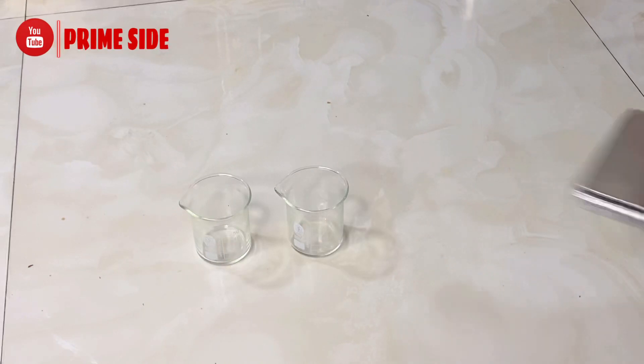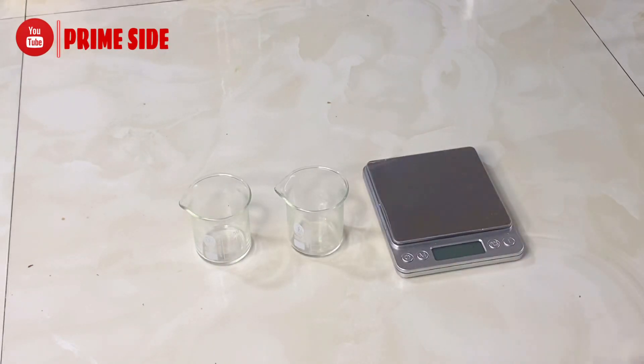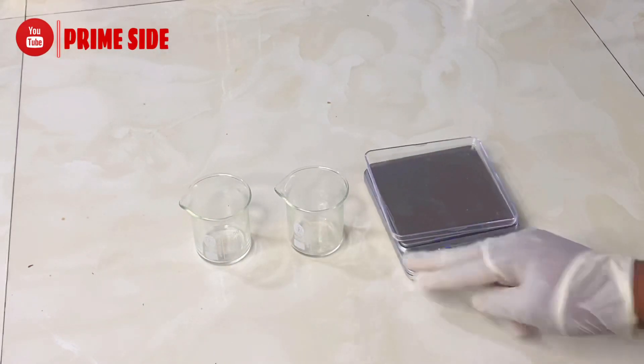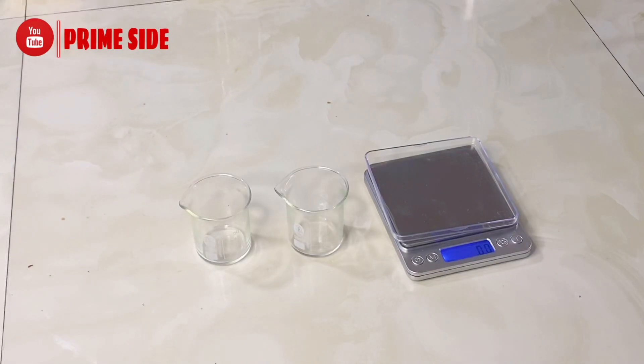So let's go straight to our experiment. Here I have two beakers, and into these two beakers I'll be measuring up five grams of salicylic acid each respectively.